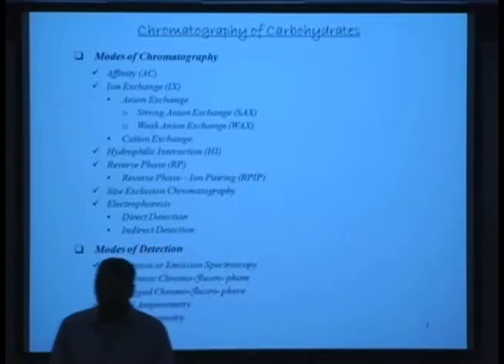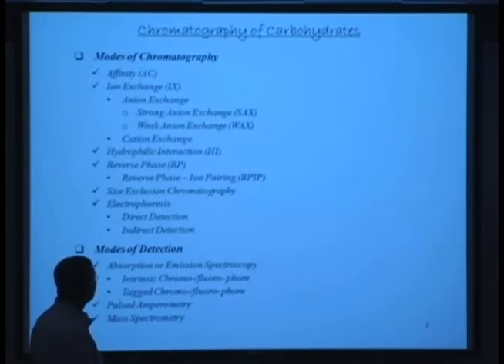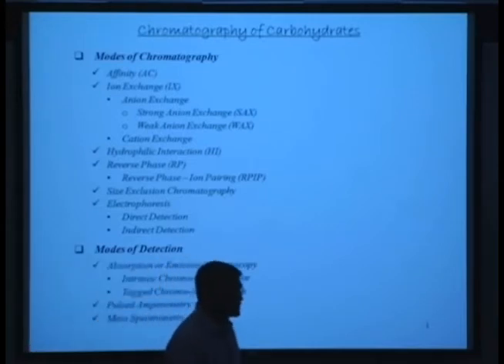After a few heavy hours of N and O glycans and sialic acid based glycans, we have something really light, which is the reason why I don't have handouts for all of you. Obviously the trainees have them in their pack, and I really want you all to simply focus on the fundamentals, really understand chromatography from the perspective of how interactions occur, how resolution occurs, and be in a position to exploit these simple rules. Okay, so this is going to be a short talk.